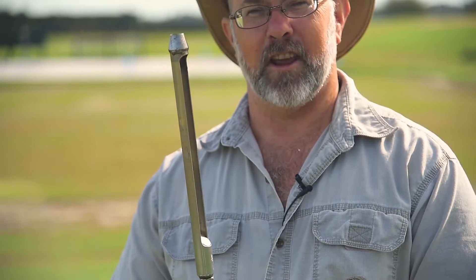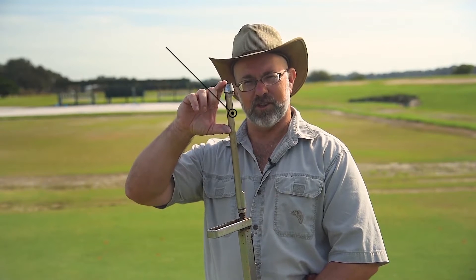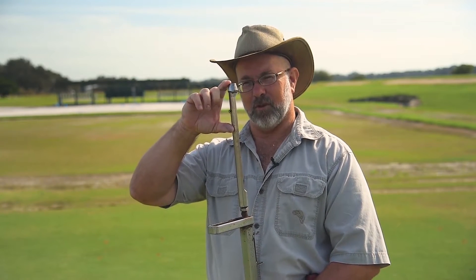Most golf courses are going to have a device similar to this for taking soil samples. These also work very well for taking nematode samples from soil. When we take a nematode sample, typically we want to take our sample down about three or four inches deep. That's where most of the roots of the grass are, and it's also where most of the nematodes are going to be.